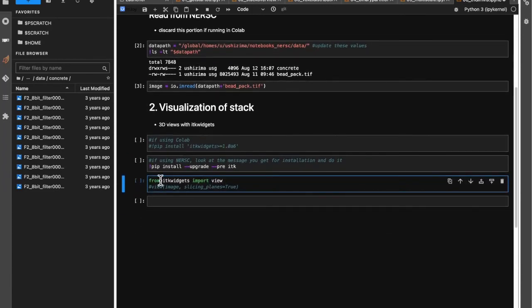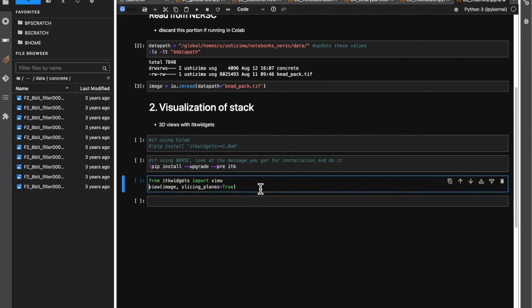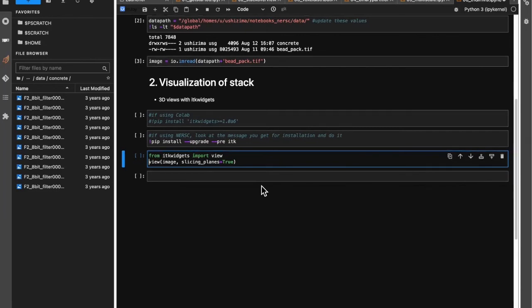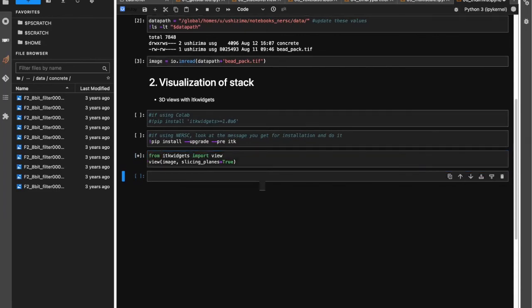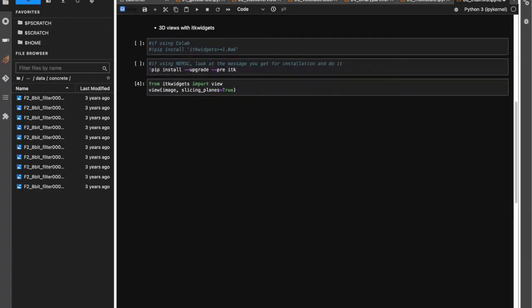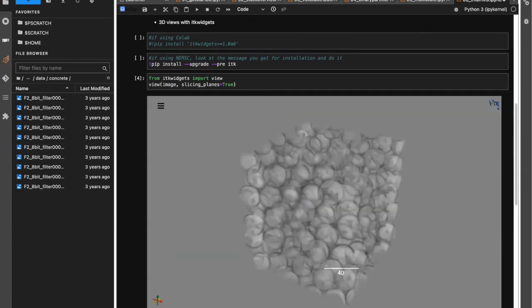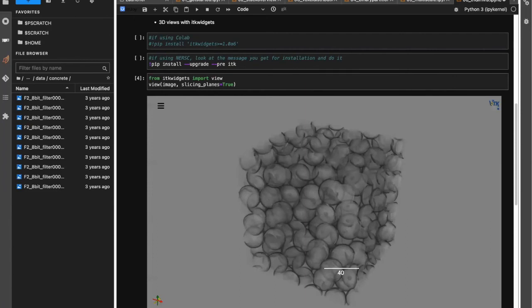It might be the case that when you run the cell with ITK widgets and try to view your sample, you might have a few glitches. First, double check that you have the smiley face — that's the Jupyter extension — enabled for ITK widgets to work. Second, you might need to run the cell again and again. So don't give up on the first time. Also, you might need to wait a little bit for the application to run. If none of that works and nothing happened, it might be the case that you need to run the command to pip install --upgrade itkwidgets.